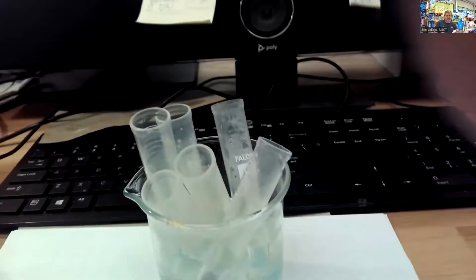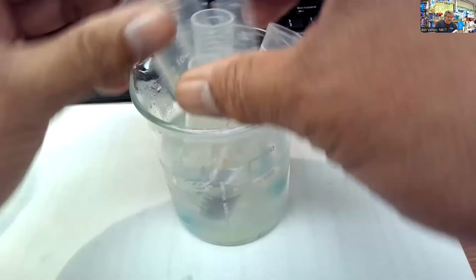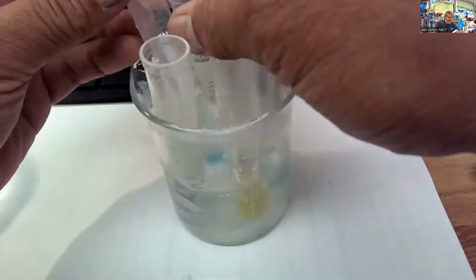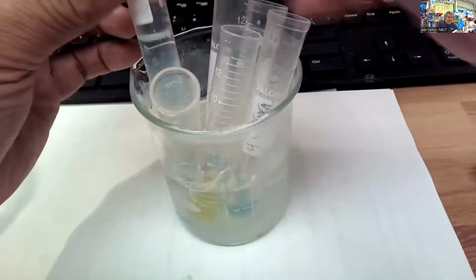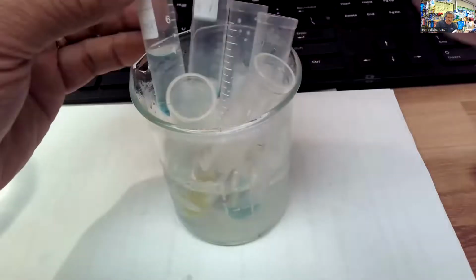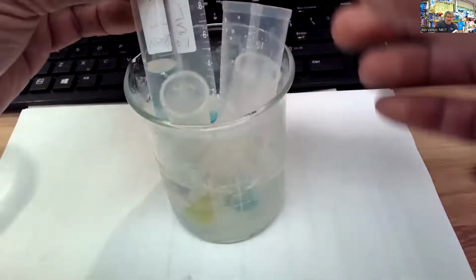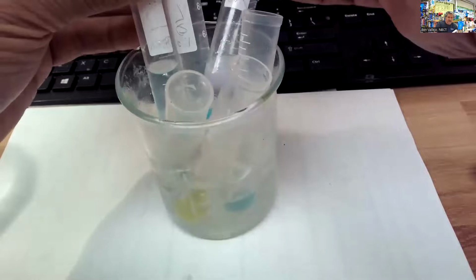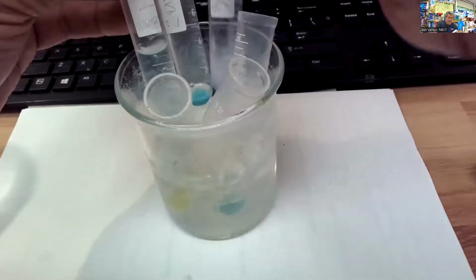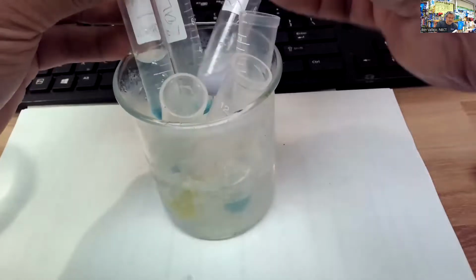Alrighty. Let me take a look at the Benedict's test. Let's see how that's going. Remember, this tests for the presence of a reducing sugar or monosaccharide. There's water. Water continues to be blue. There's the oil. It's also blue. Right there, it's 1 and 2. There's number 3. Already you can see something happening. Milk. But is it orange or yellow or red?